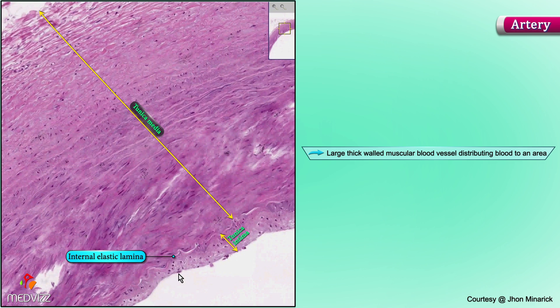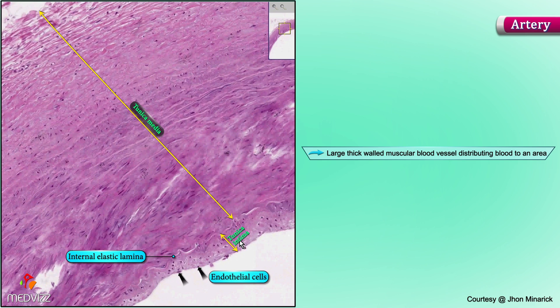The very most superficial layers of the intima — perhaps here, perhaps here, perhaps here — are the actual endothelial cells.